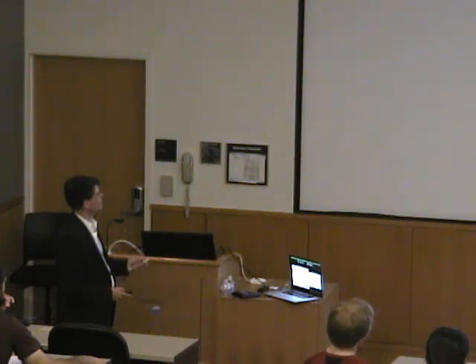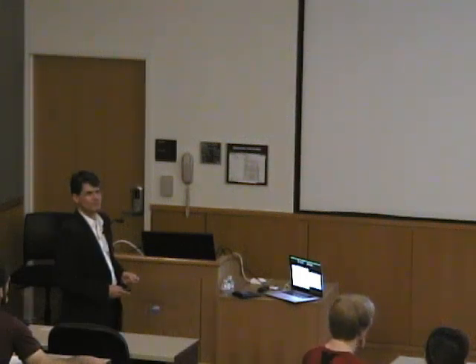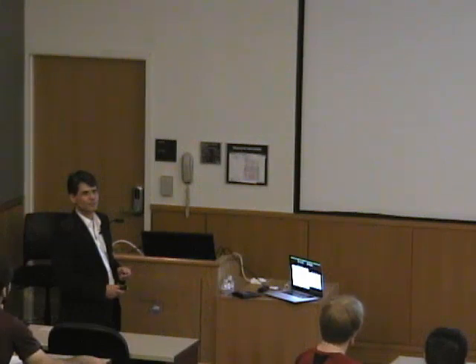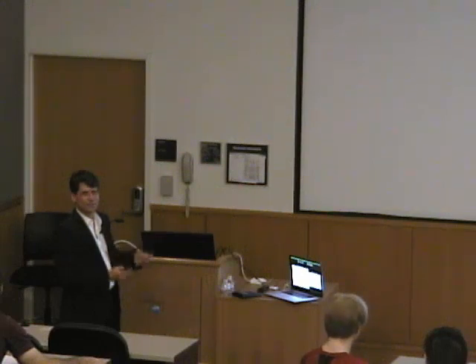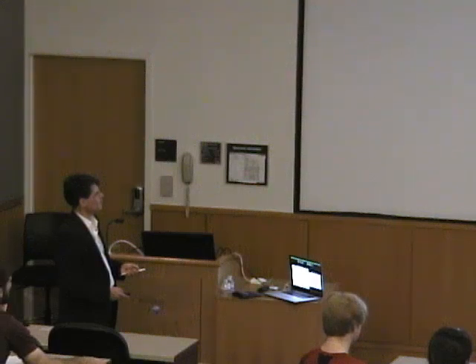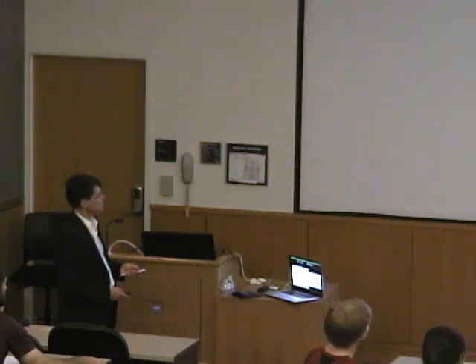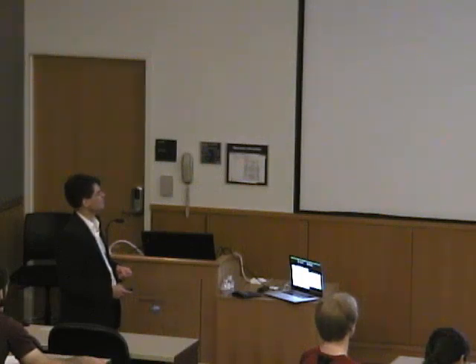Whereas here, if I take the data here, then I get these so-called nested curves where everything overlays for each temperature. So are you confused? That's good, because that hasn't been understood for a very long time, and it calls for an explanation. But just for the moment, take it as part of your curiosity. What you have observed is that the magnetization behavior of the MCD depends very strongly on the wavelengths at which you take the data. So there is lots and lots of information in that data. You only need to understand how to make it usable, and I will tell you that.